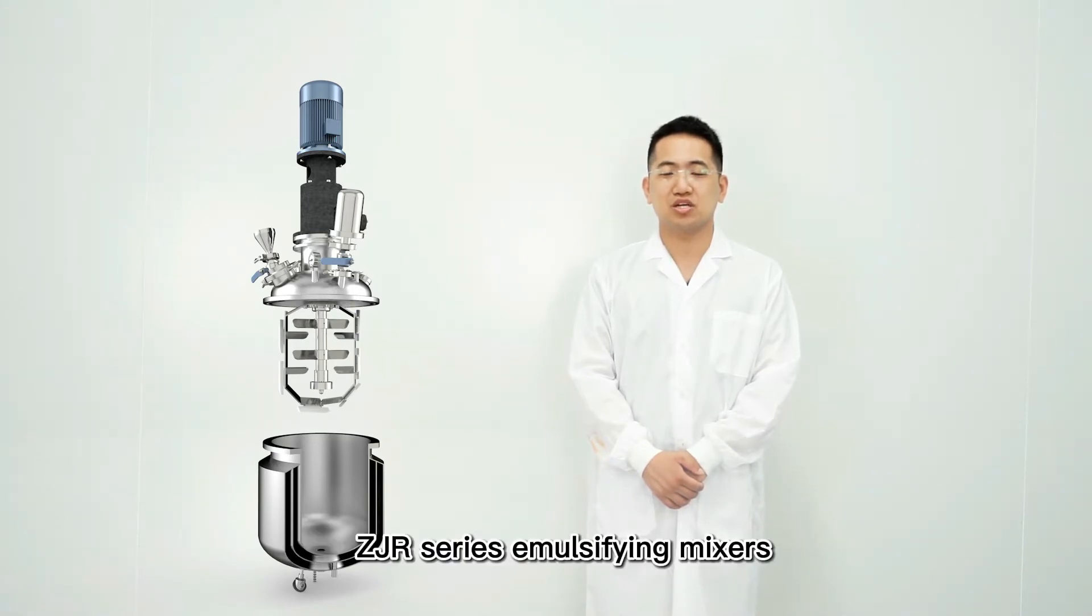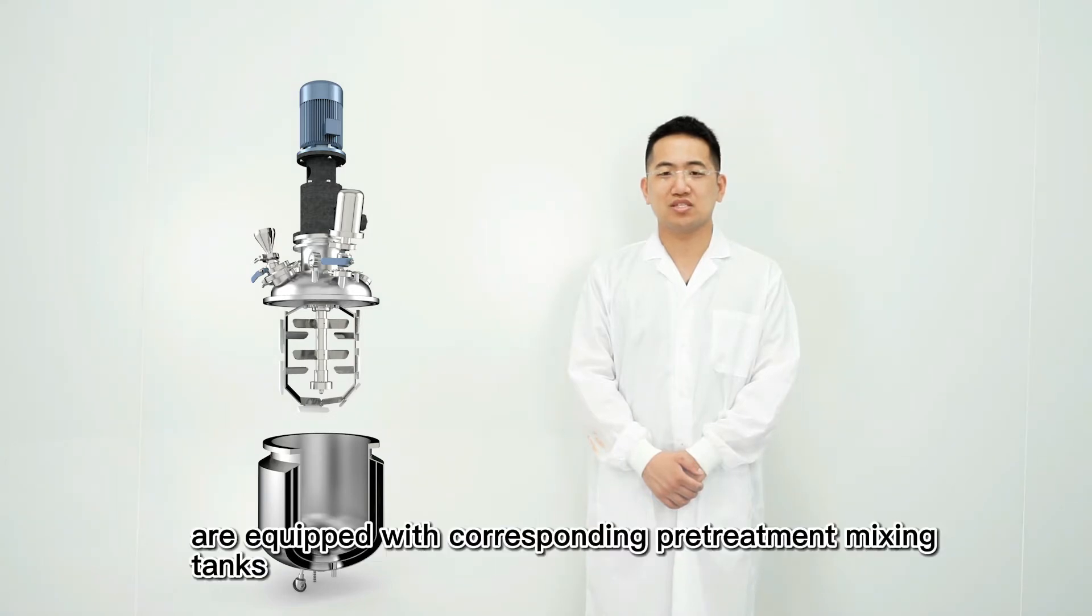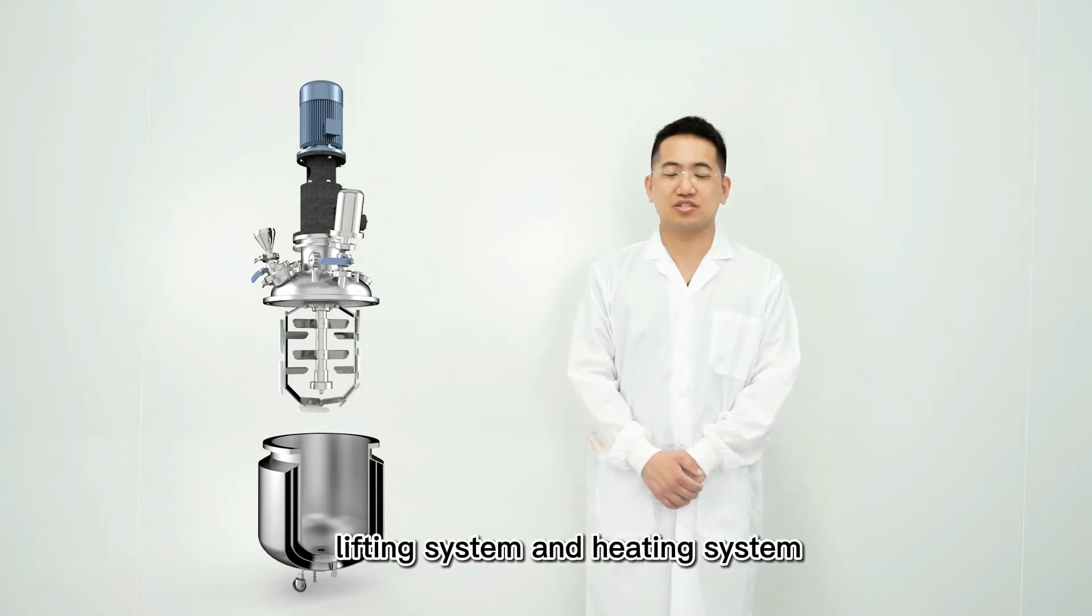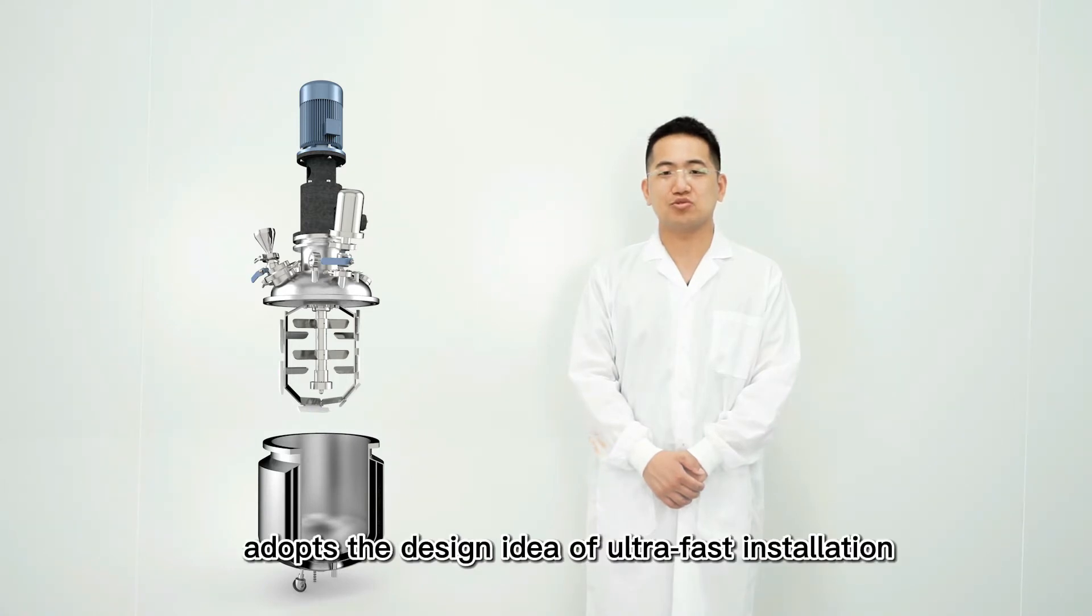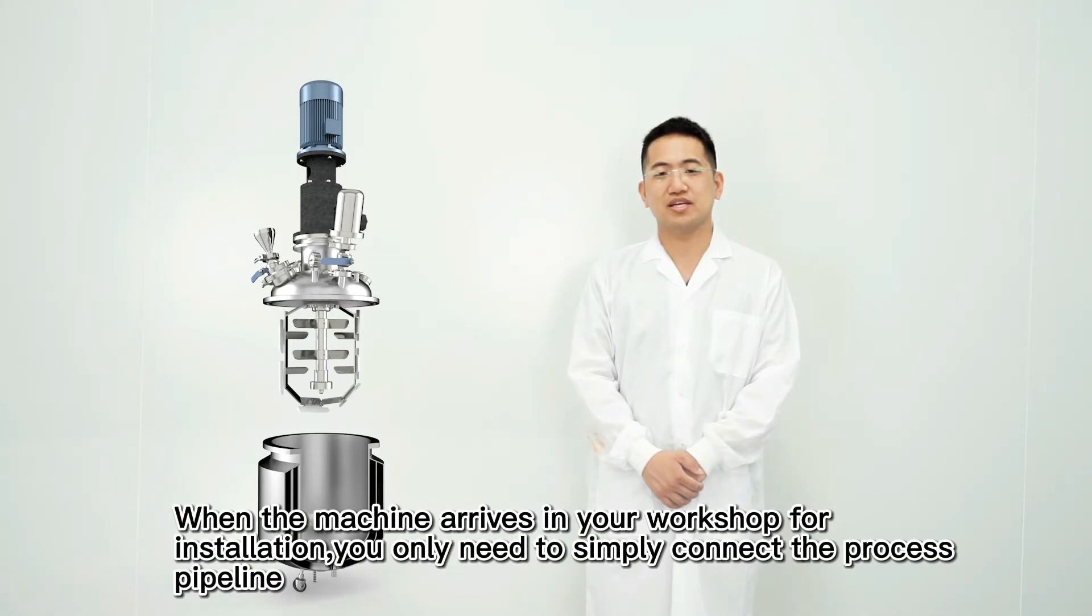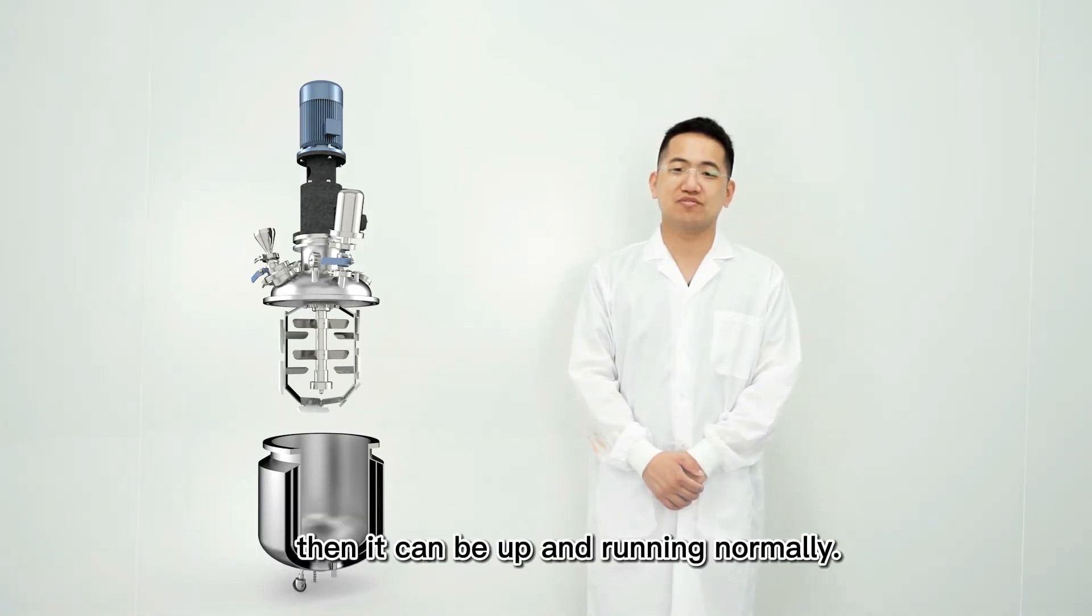The ZJR series emulsifying mixers are equipped with corresponding pretreatment mixing tanks, vacuum system, lifting system, and heating system. The ZJR series adopts the design idea of ultra-fast installation. When the machine arrives in your workshop for installation, you only need to simply connect the process pipeline, then it can be up and running normally. It is easy to complete.